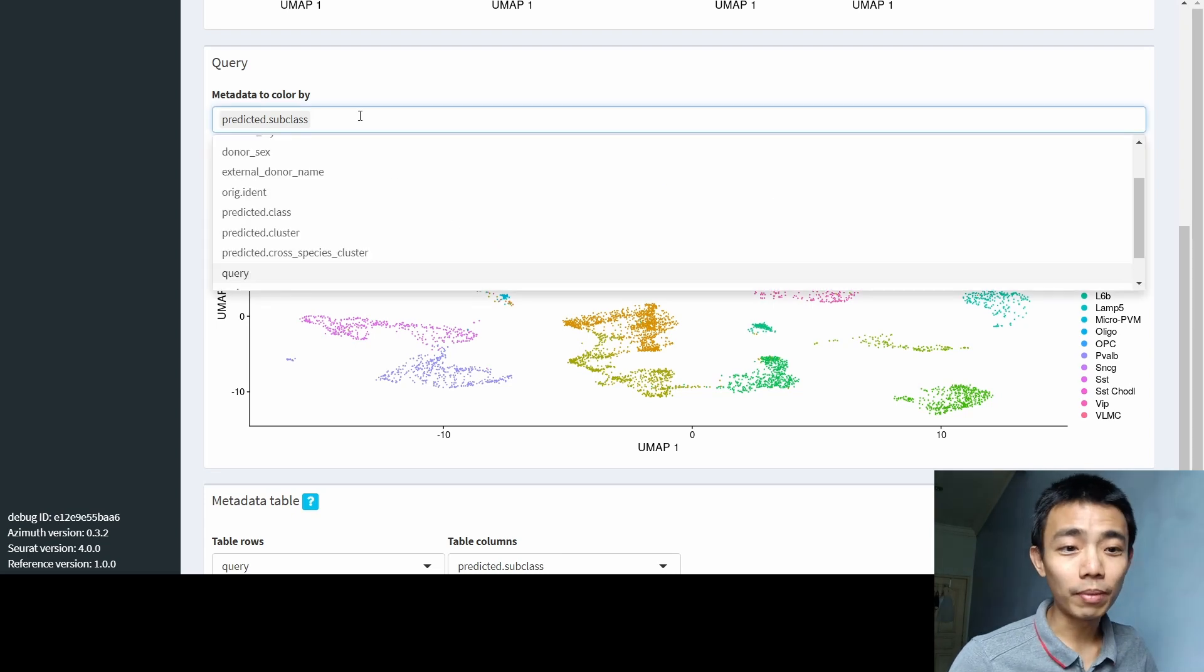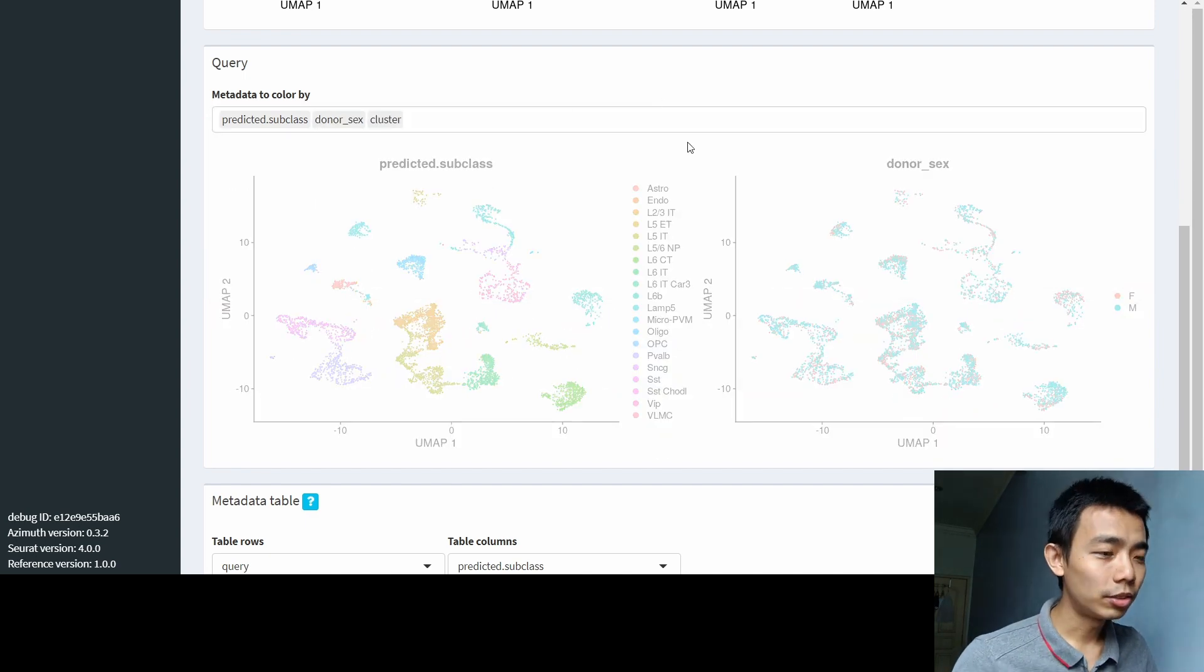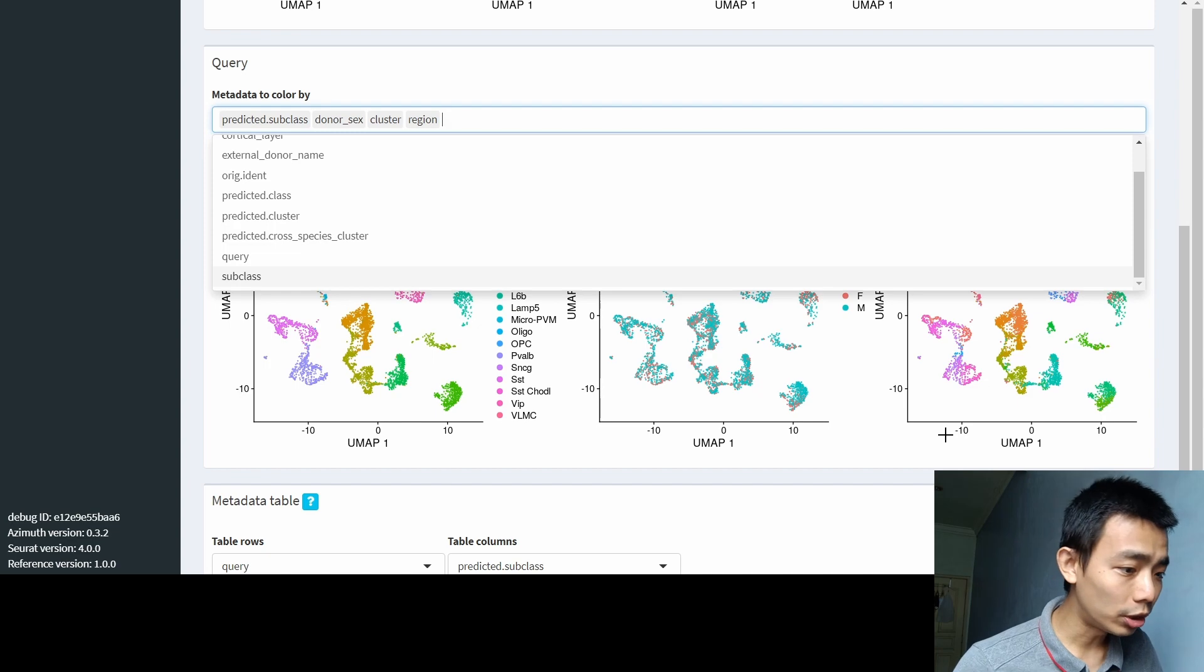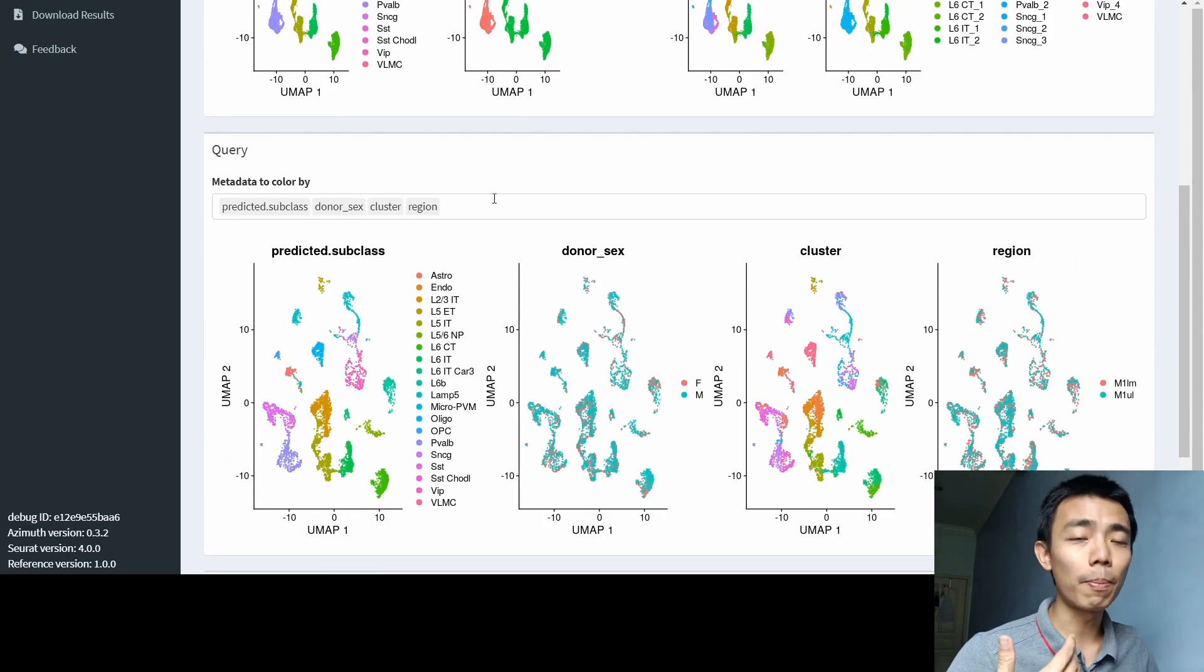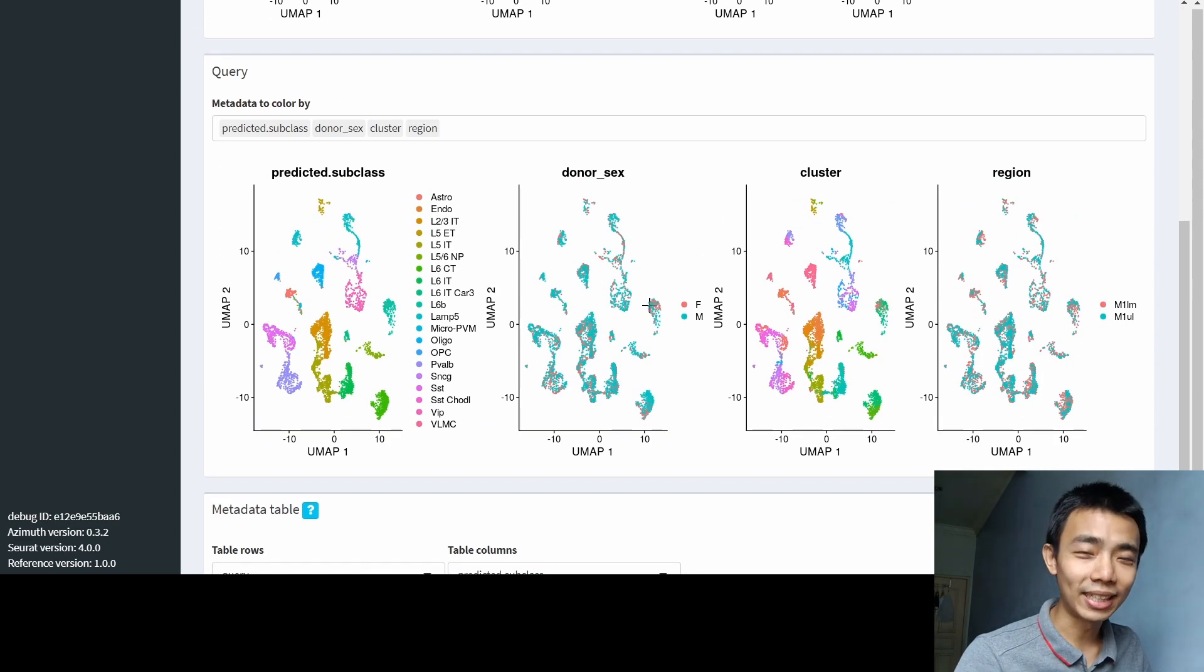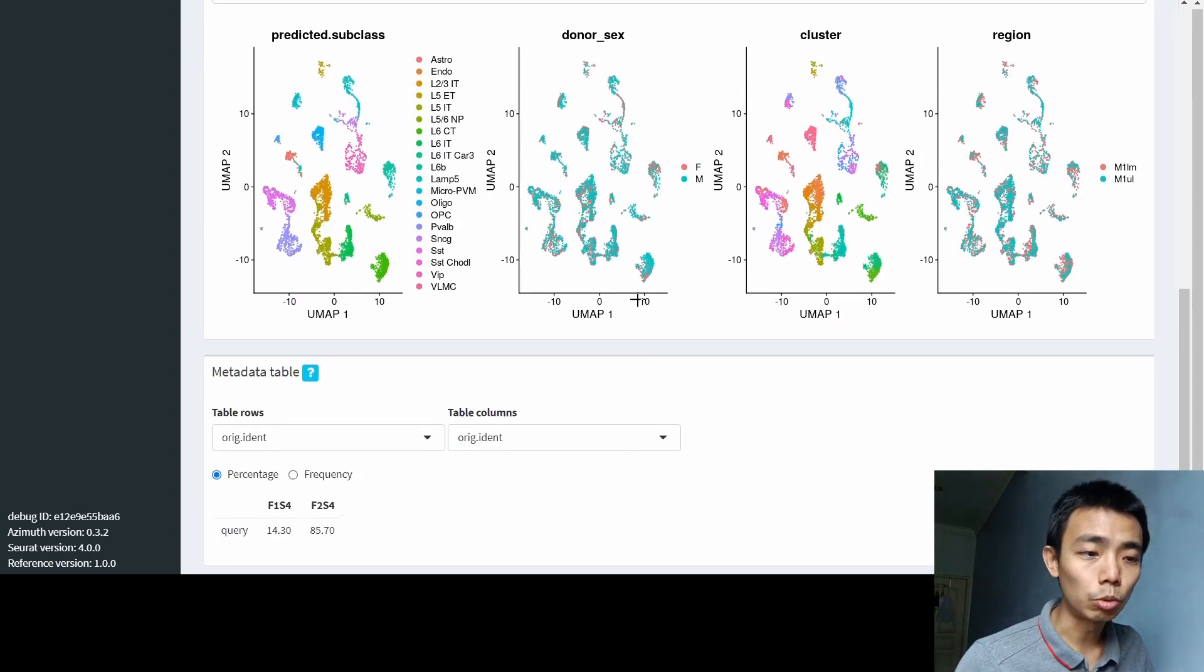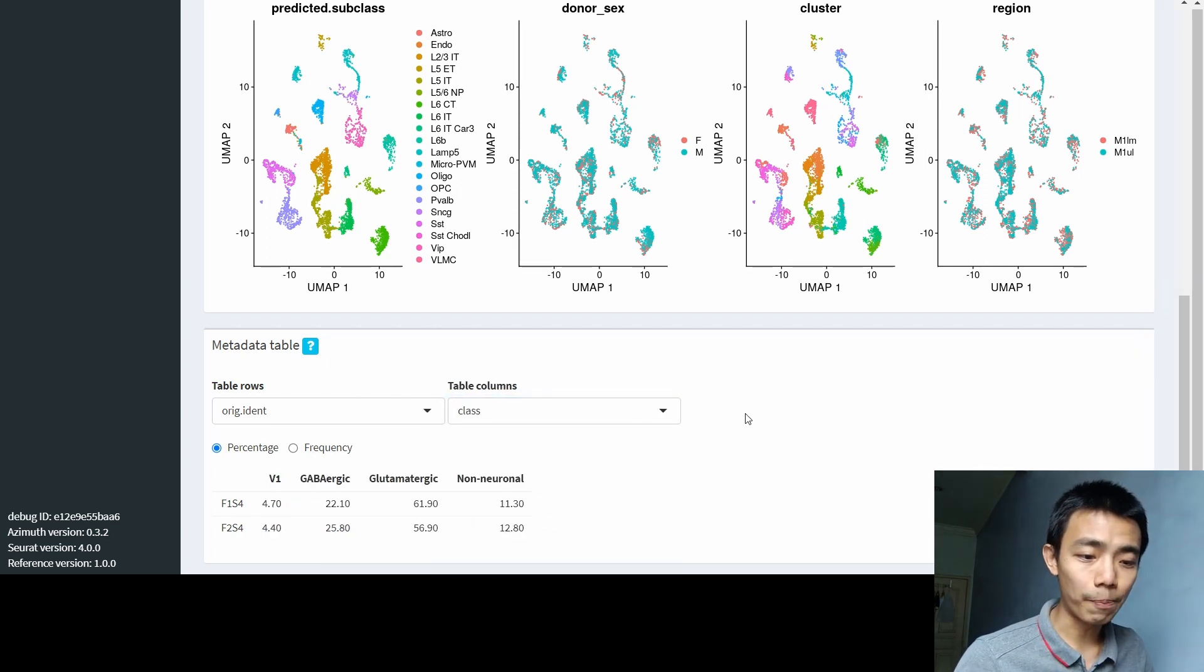Besides that, you can also do the metadata coloring. For example, I want donor sex and maybe cluster just to have a different look. This is male and female and the different types of clusters. Multiple types, for example, region. Maybe just put another region to see there's M1, UM, UL, and you can actually just color it based on different metadata that you have. There's however much you have inside a Seurat object. And if you want to have it here, you have to add it into a Seurat object before you upload it. The last one is a meta table, which is actually similar to what we see above, just in a table form. That's easier to export the data or do any kind of further meta analysis that you want.